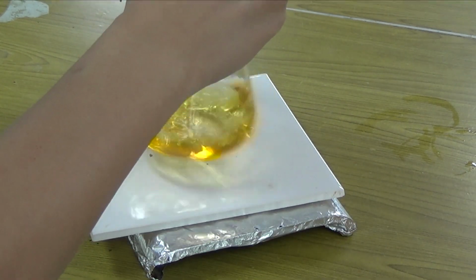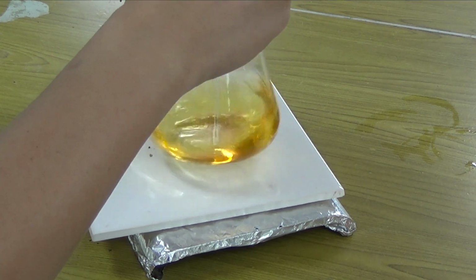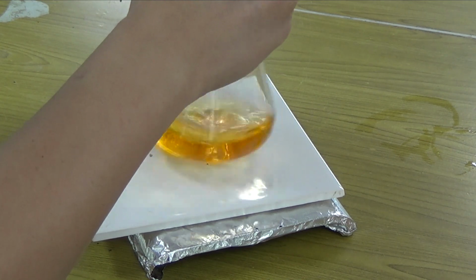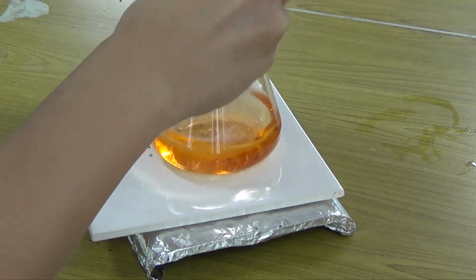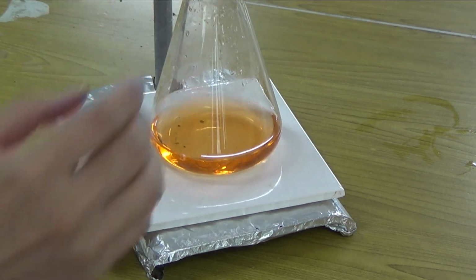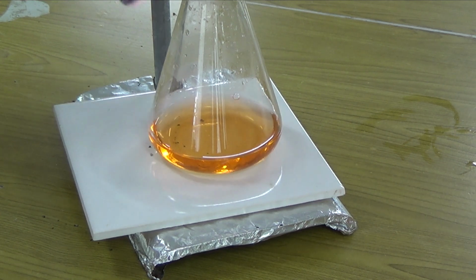My eye is just focused on the color change. When you go from yellow all the way to orange, that is when I stop. There you go. It just turned orange. It was just yellow a while ago and it's gone orange. And I can confirm that I have got 32.8.